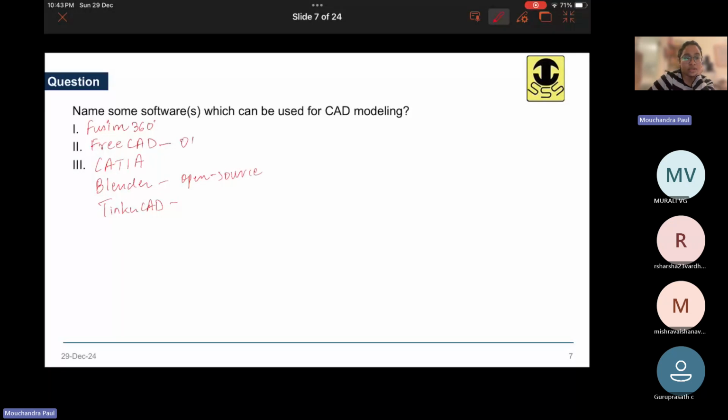But every software will generate a CAD file in its own format. All these formats must be exported to .stl file for 3D printing. Okay, that's the important thing to keep in mind before you start the 3D printing process.